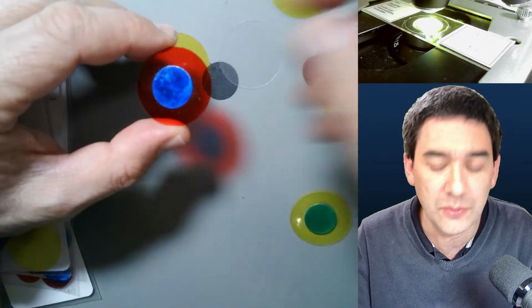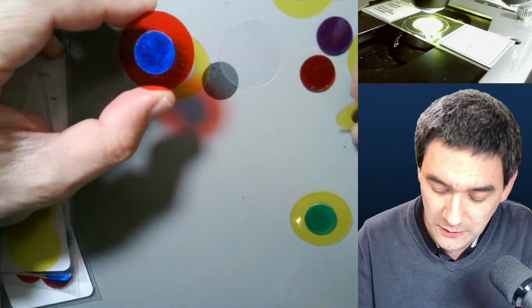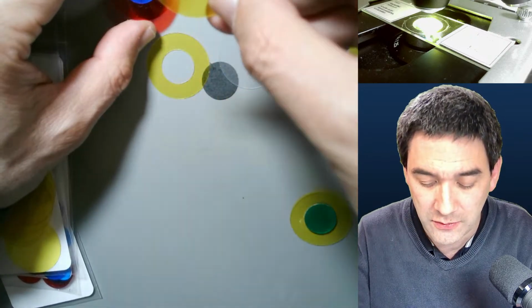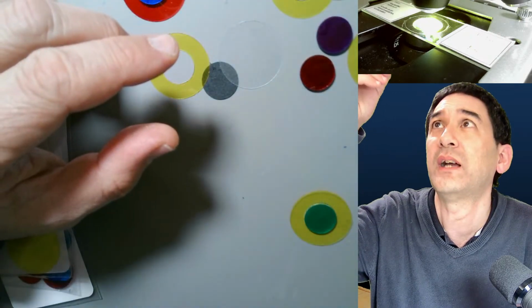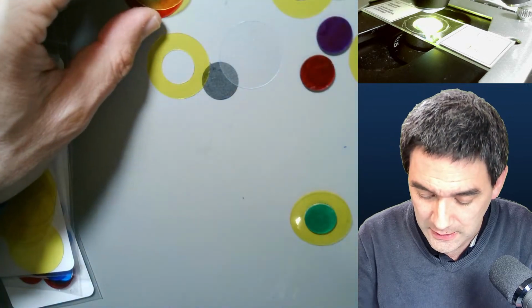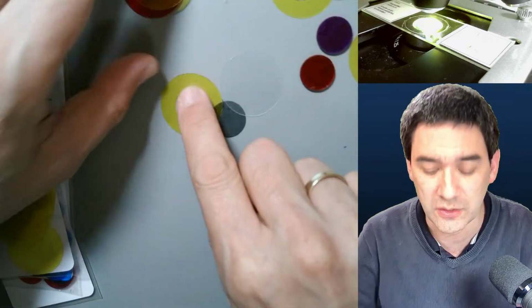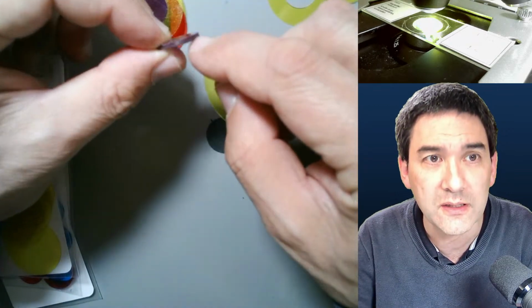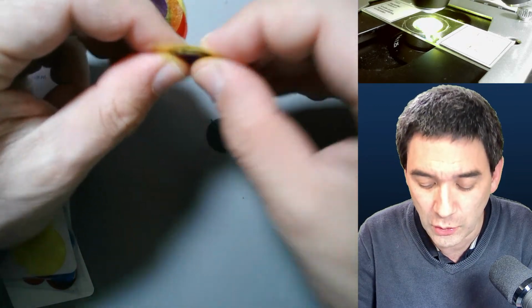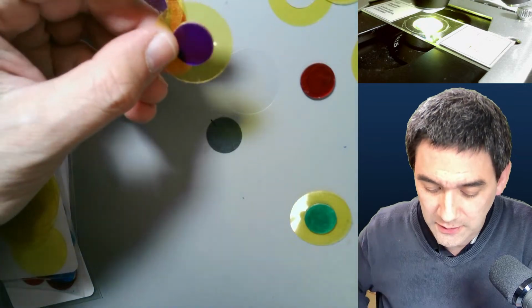And what you can do is now you can combine, of course, different colors. For example, of course, blue in the center and red on the outside. Here, this one over here is, I don't even know what. This is very dark blue and yellow. Okay, and you see that sometimes there are those rings here which are completely empty, and then you're able, and this is a little bit thicker here, you're able to push one of these things in here, and you're able to make your own color combinations this way, right?